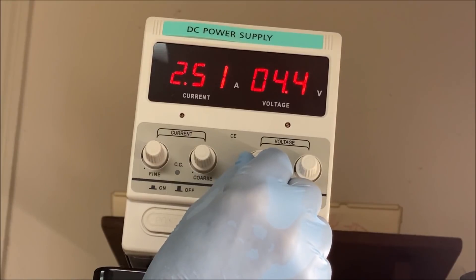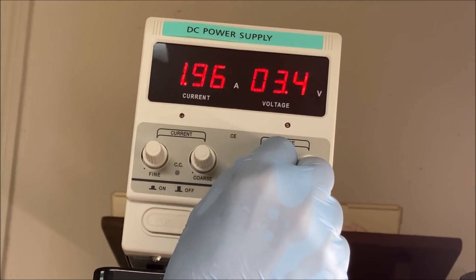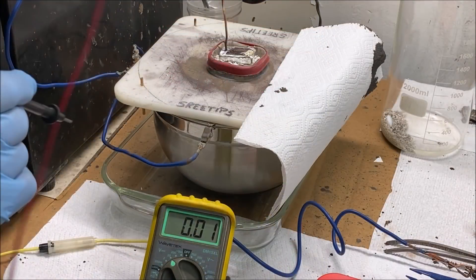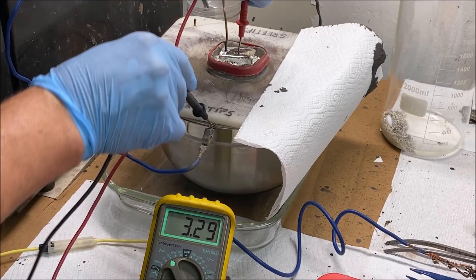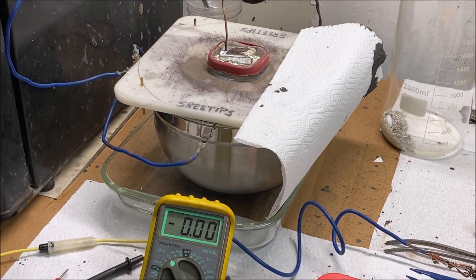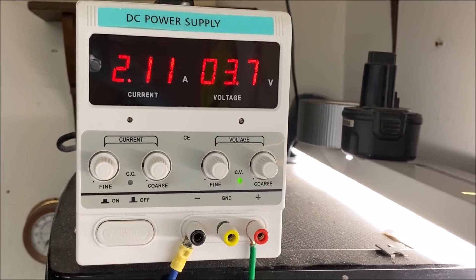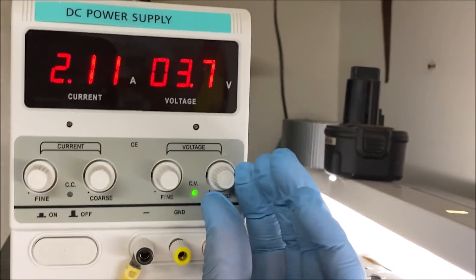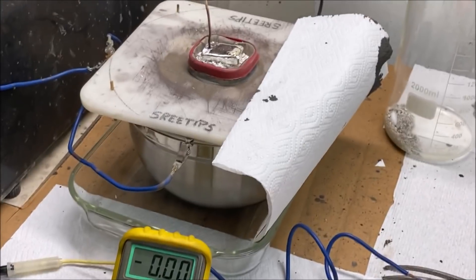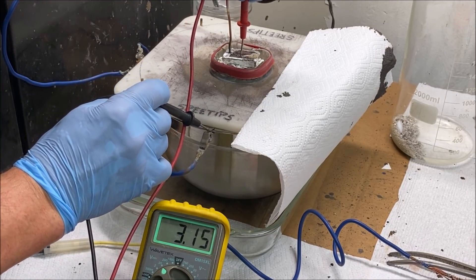Look at that — the voltage changed. I may have hit the adjustment when I was installing the new cable. I'm gonna put it back to 3.7. See what kind of voltage we're getting right down at the cell. Holy cow — it's the same as up here on the power supply now. Wow, that was a huge improvement. I'm gonna turn this back down to 3.5 now. That was a huge improvement and a very beneficial suggestion by Darryl Daniels. Just goes to show you how important it is to pay attention to these comments.